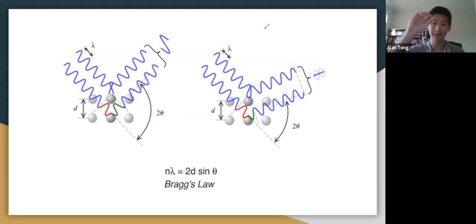That's the key. If you rotate your sample, or some machines, I guess, rotate the X-ray source, if you rotate the angle at which you're shining your X-rays at your sample and the angle at which it scatters off also changes, at specific angles, you will get signals. At others, you won't. And you can use some math to work backwards, to work out where those angles were. Now, notice here that we had to have this array.